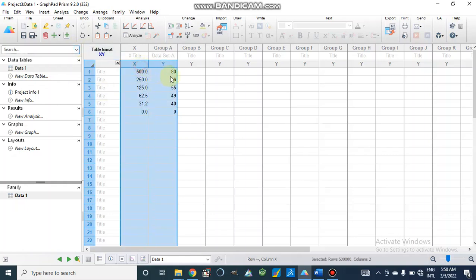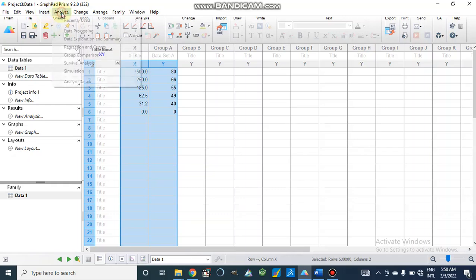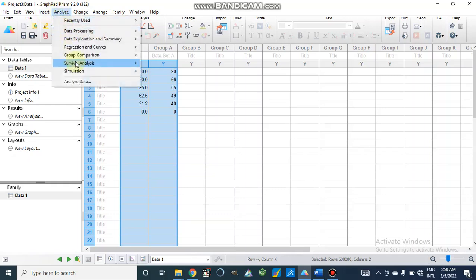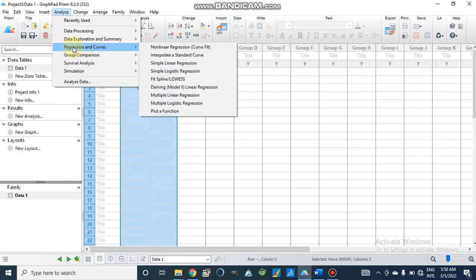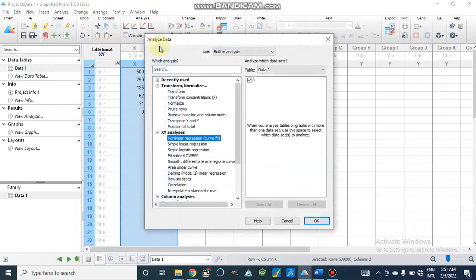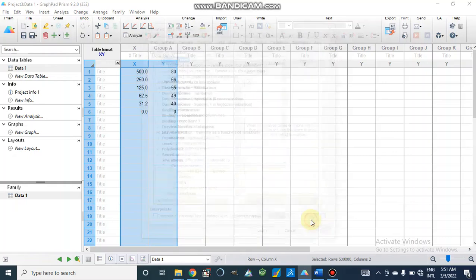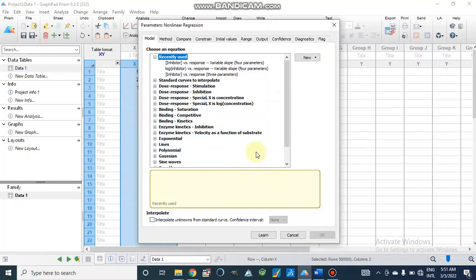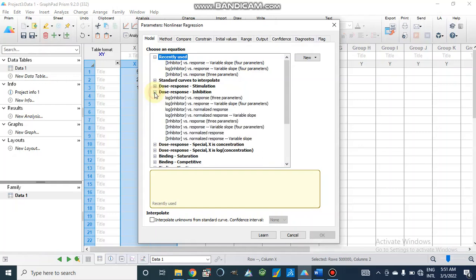When we are going to plot this we will go to Analyze, go to Regression and Curves, non-linear regression curve fit. We will go to non-linear regression. We can choose recently used or I will show you that we will go to dose response inhibition.